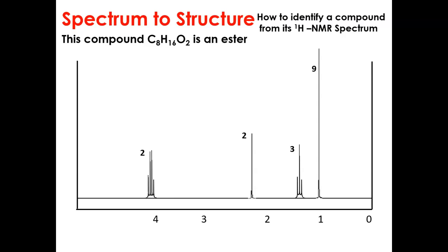And of course, we can see the chemical shift scale at the bottom, remember, measured relative to our TMS reference at 0. We can see there are 4 distinct peaks from our compound. And also, we can see the numbers alongside, which of course are the integration values, which tell us the number of H's in each of the 4 environments.